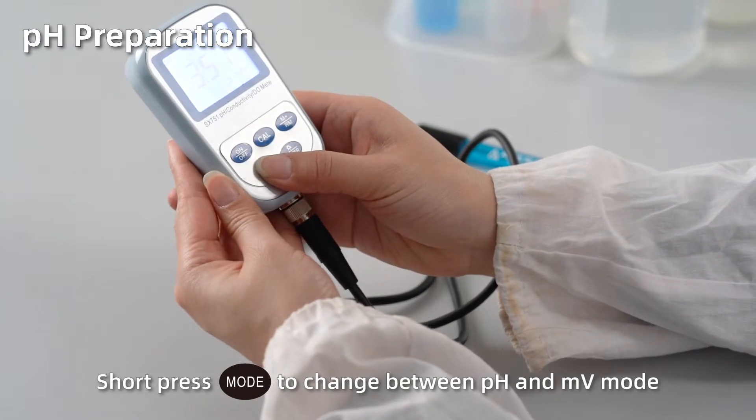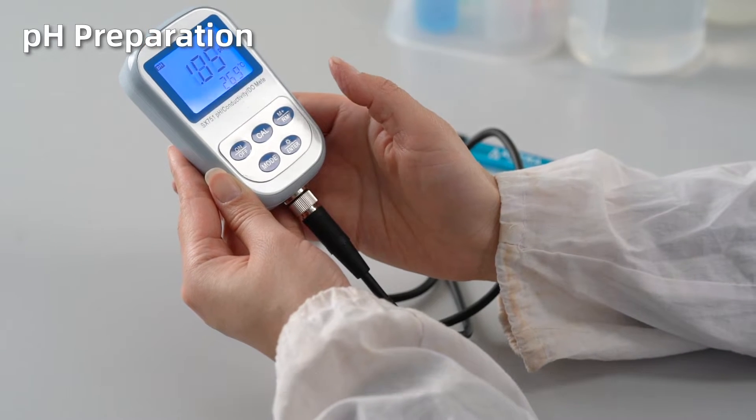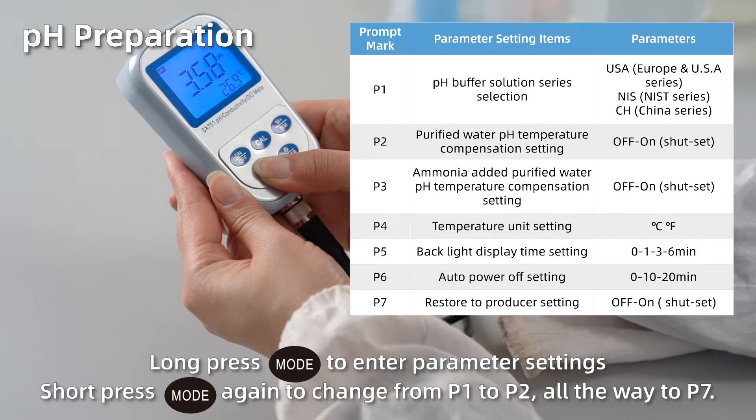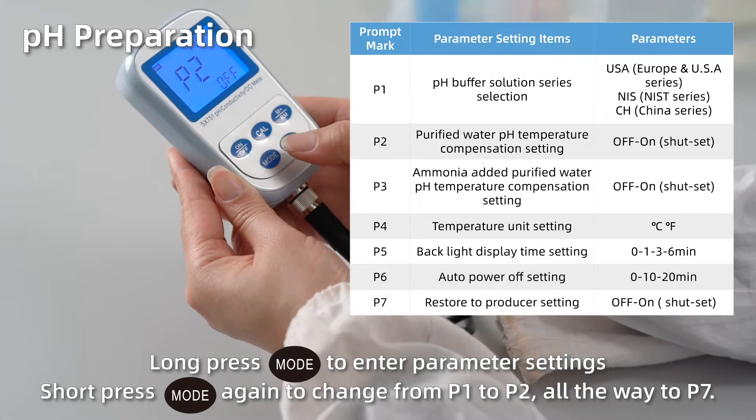Short press mode to change between pH and MV mode. Long press mode to enter parameter settings. Short press mode again to change from P1 to P2, all the way to P7.